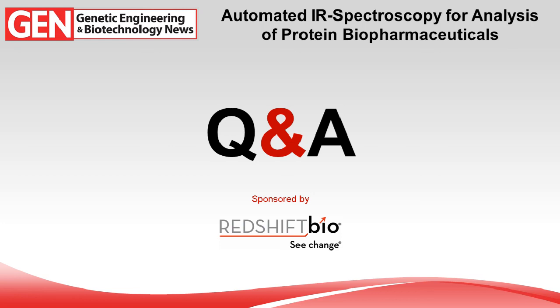Oh, that's a great question. Someone really knows IR spectroscopy. We address that on a couple of different levels. The system is based on a QCL, or quantum cascade laser, and it's a tunable laser. On the most basic level, we choose the wave numbers to slightly avoid or miss the major water vapor lines, so we're not hitting right on those lines.